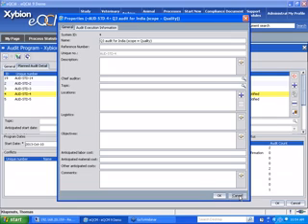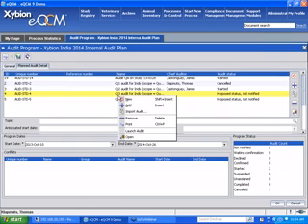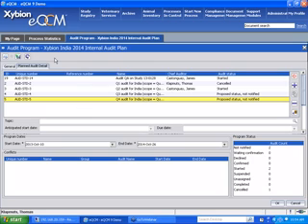And so you have the ability to add these things and then just copy. So you can add another one. You can import an audit. So if you're running the same audit again that you did before on the same items, you can import it back in. And then if you wanted to launch it right from here, you could launch it. So that's for planning out audits over time.